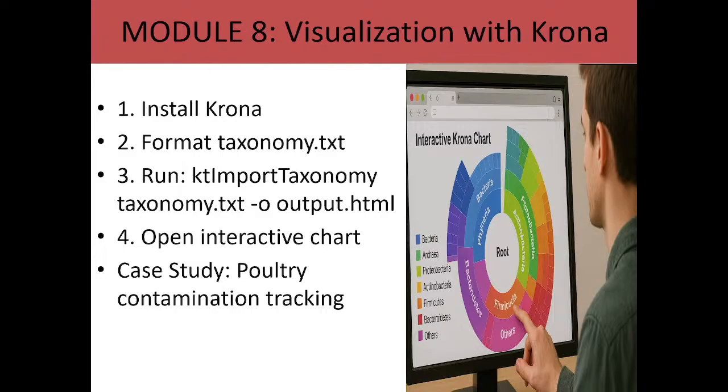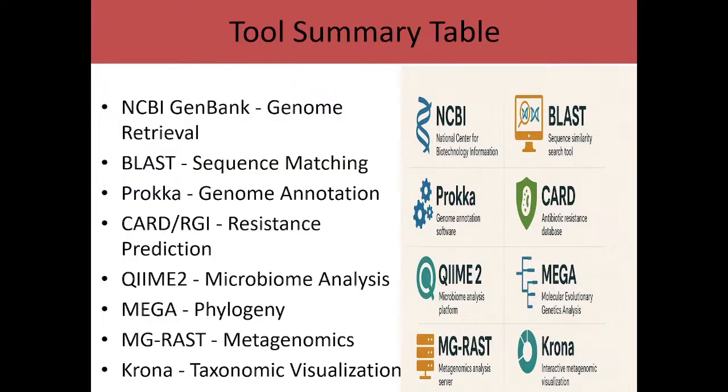You just click on run. When you click on run, it's going to generate an output for you. By the time it generates the output, you go to step 4, and that is to open the interactive section. There you will see a case study of poultry contamination using a tracking method.